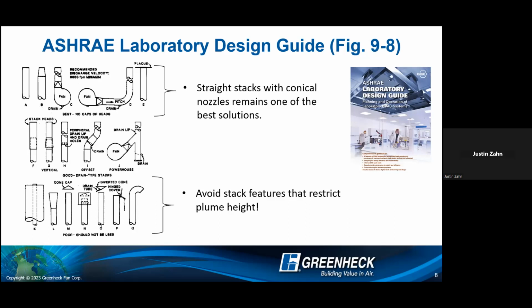So moving on now, we will talk just a little bit about the best practices and the worst practices as far as design guides when it comes to these laboratory exhaust systems. We'll start on top here where it says best. It's really not all that complicated when it comes to how you want to design your stack. The best thing to do is straight stacks with no caps or heads, so nothing to potentially deter that plume height.